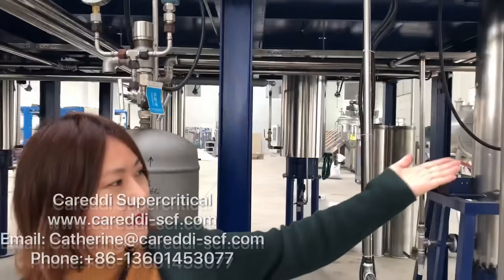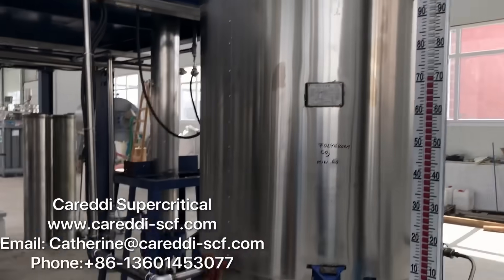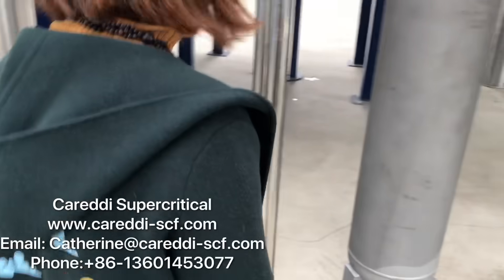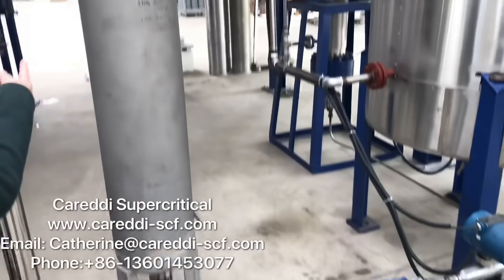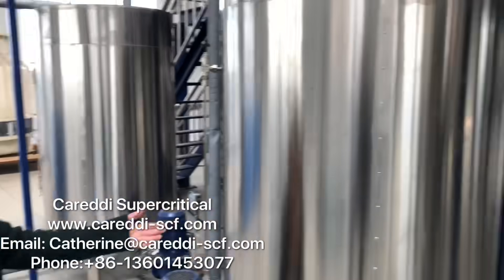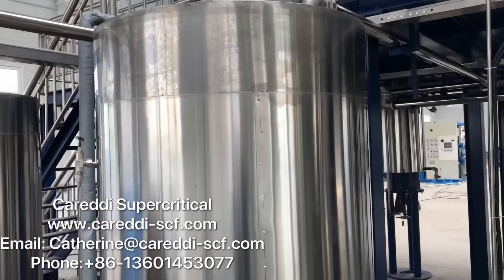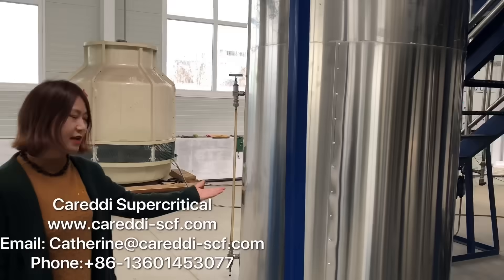This is the CO2 storage tank. This is the recycled CO2 tank. This is the hot water tank. This is the cooling water tank.